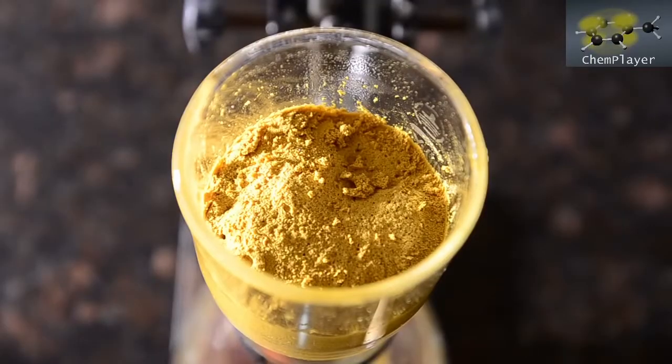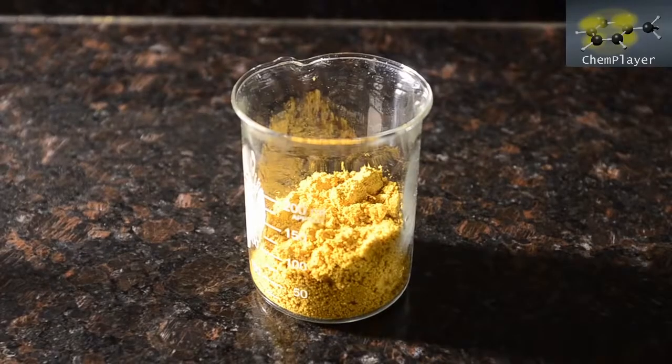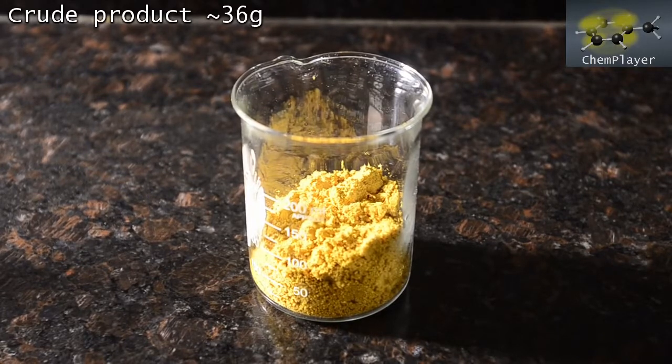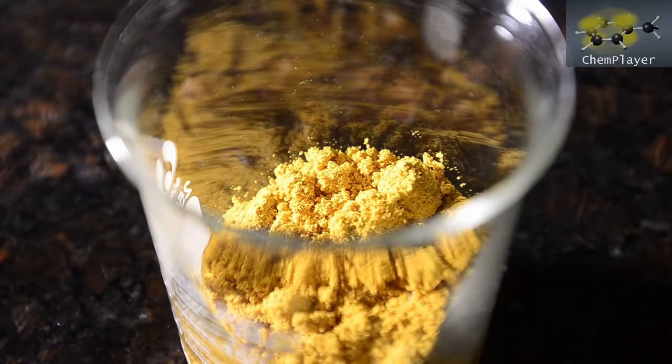And then we dried the solids as best we could on the pump. Okay, here's what we've got. It's quite fluffy but not completely dry, but it's 36 grams of yellow product. So there's definitely some kind of weight gain, as we'd expect from a nitration process. But we're going to have to purify this in order to see if we've actually got 5-nitrovanillin in here.